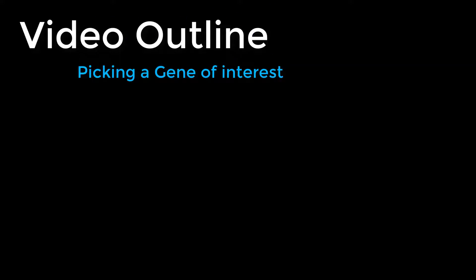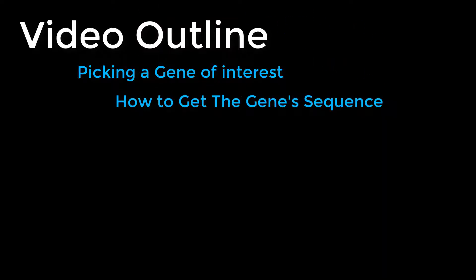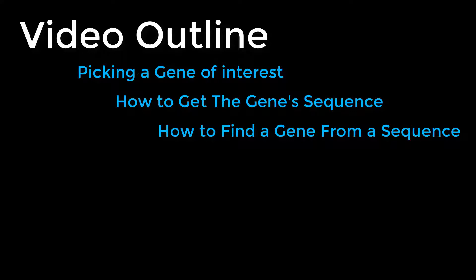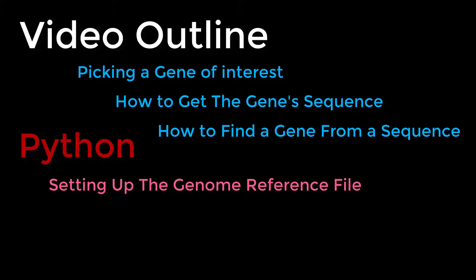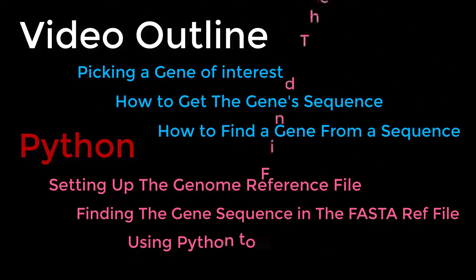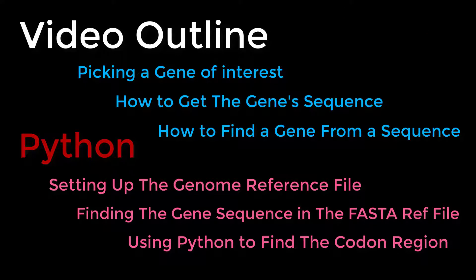Here's a little outline on how this video is gonna go: we're gonna start by picking a gene, then we're gonna find that specific gene's sequence. We'll also cover finding a gene if you just have a sequence. Then we're gonna move on to coding in Python — setting up our genome reference file, finding that gene in it, taking our gene sequence to find where it's located in the FASTA file, and using the coding region to separate the pieces of the gene that actually code the protein.